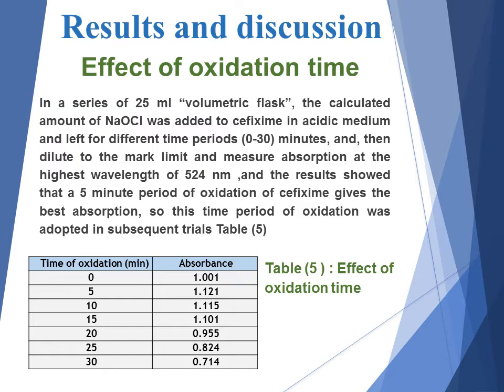The results showed that a 5-minute period of oxidation of cefixime gives the best absorption. So this time period of oxidation was adopted in subsequent trials as shown in table 5.